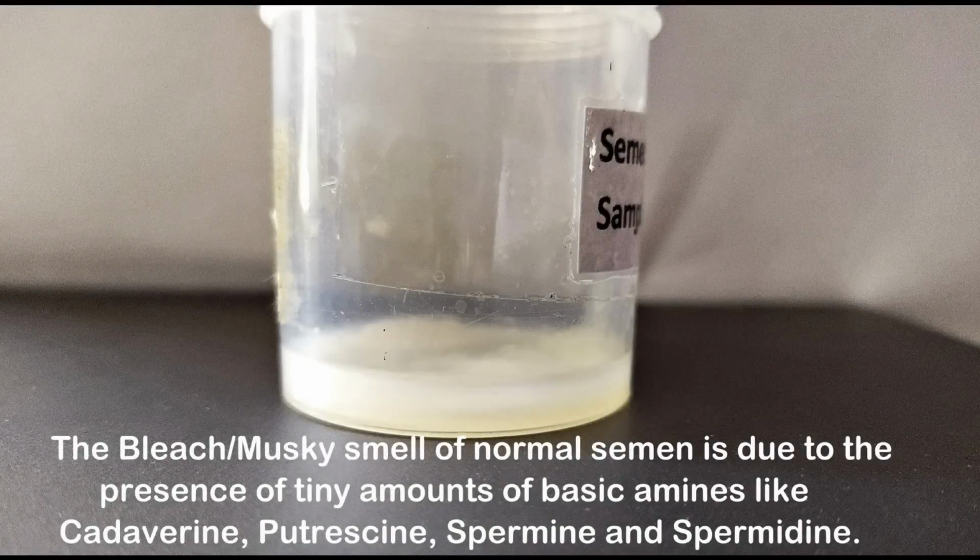Normal semen has a characteristic bleach or musky smell due to the presence of tiny amounts of basic amines like cadaverine, putrescine, spermine, and spermidine. Slight variations to this smell could result from a person's diet, including certain medications.